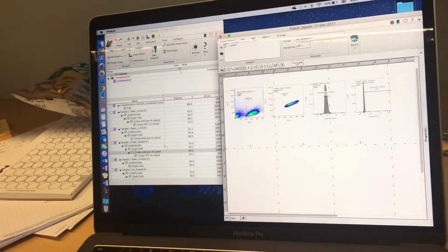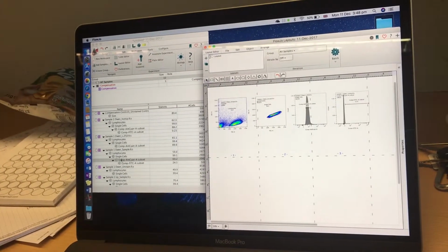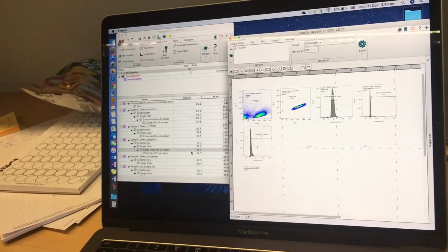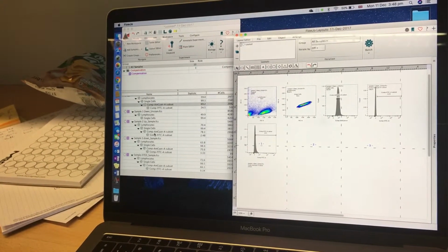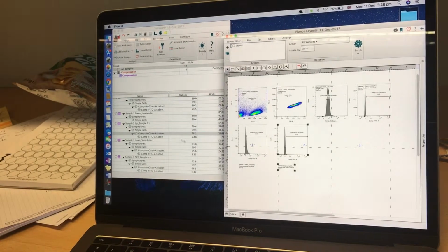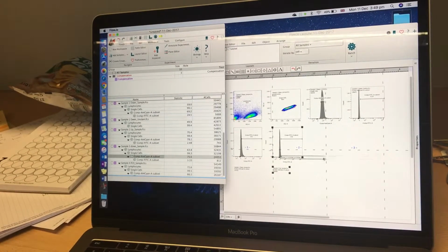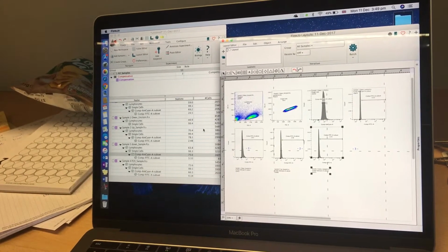Because you've built it up over different samples. And now for your results, you can just do this. This is the sample. You don't have to repeat it again and again because they're all the same. So this is them, and then which else? You did up, right? So up is like nothing. It's 2.48. Tiny. There's barely any expression there. Down is 3.3. Barely any expression there as well. So that's like negative.